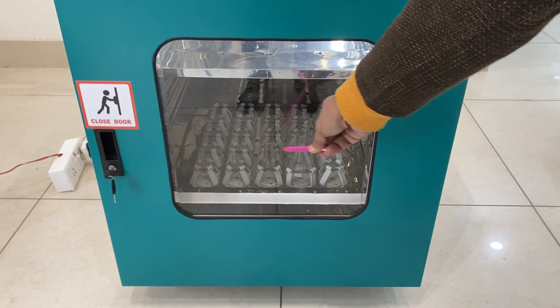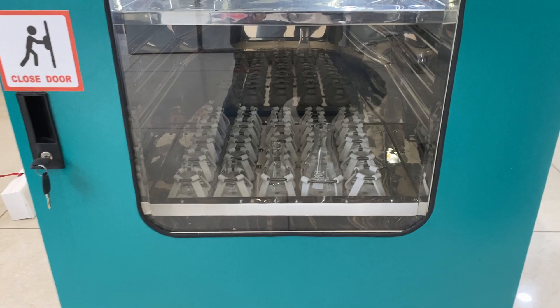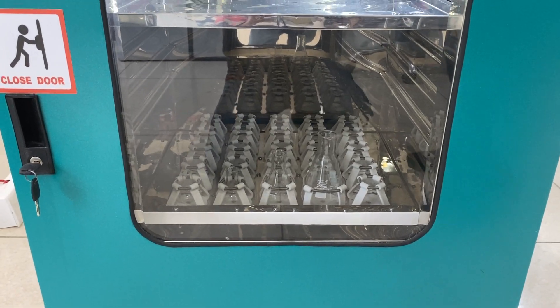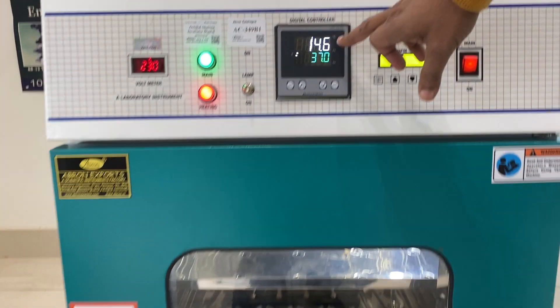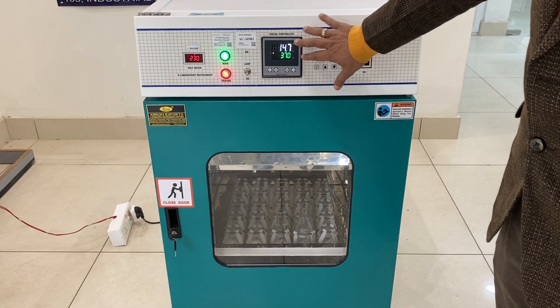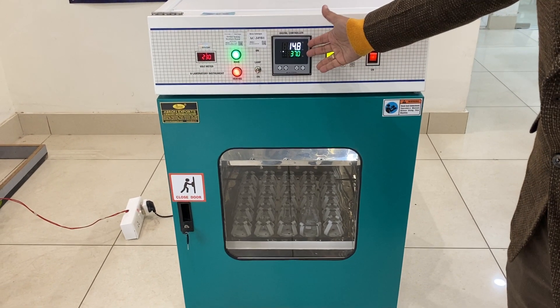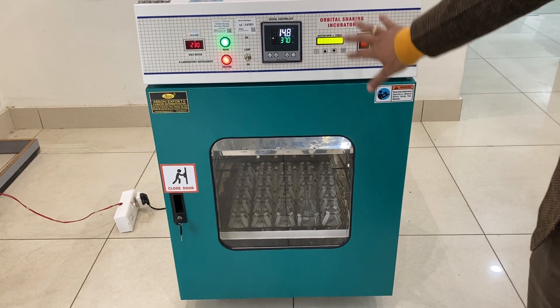Press Start and it will start. You can see the tray has started moving. The tray is moving in a clockwise direction slowly and will increase in speed. The temperature is still increasing. Before doing any experiment, it is better to first reach the desired temperature.